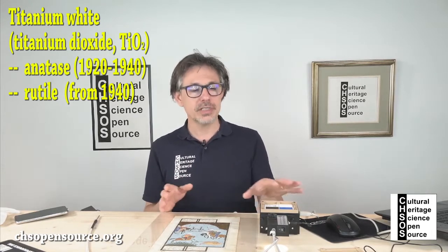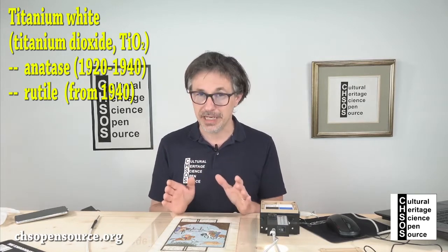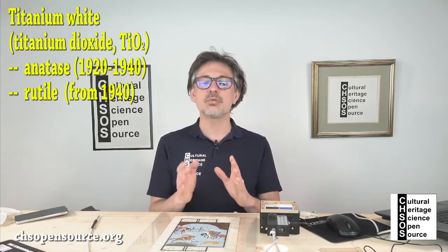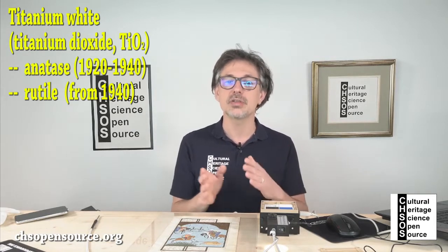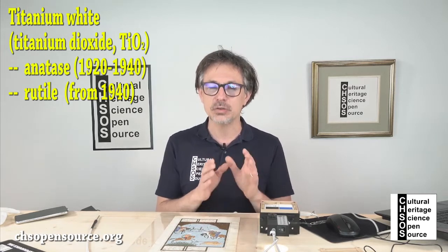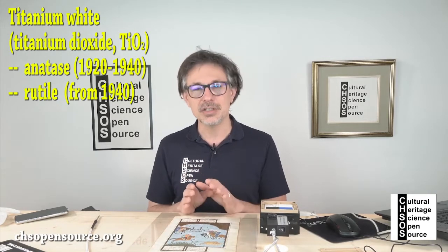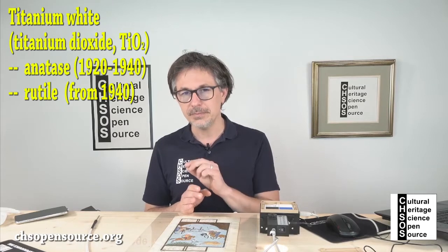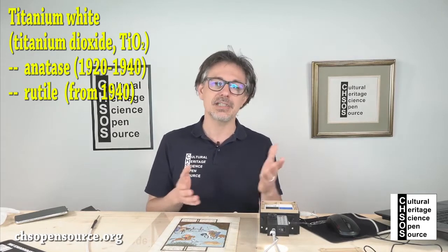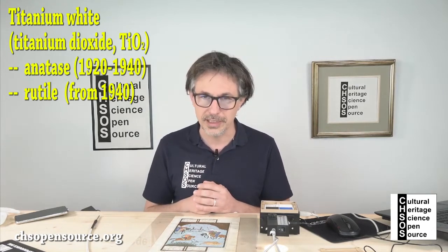Now, using reflectance spectroscopy, we can better define the time frame. If it's anatase, it was made in the early 20th century, so between the 1920s and the 1940s. If it's made of rutile, it can be made yesterday, because nowadays we just use rutile.